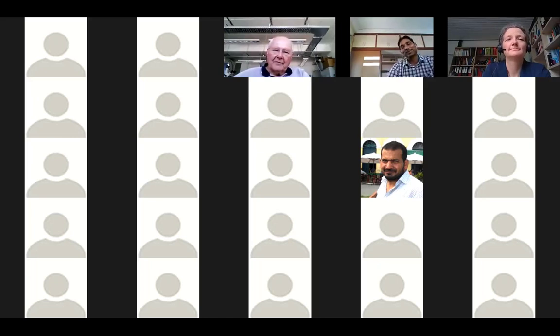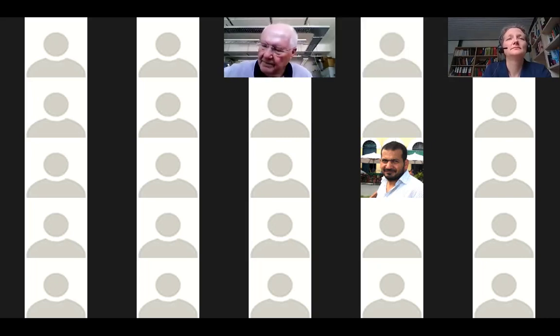Nice discussion. Thank you. Sir, myself Kaushik, I have one question. Sir, I am using that Wobrauschek instrument for the last 7 years. And right now, while we are using chromium excitation, there is a huge background, maybe because of electronic noise. So due to that background, we cannot go beyond fluorine. If you want to analyze carbon, you cannot see that peak because of that huge electronic noise. Is it because the magnetic trap is not working or something?